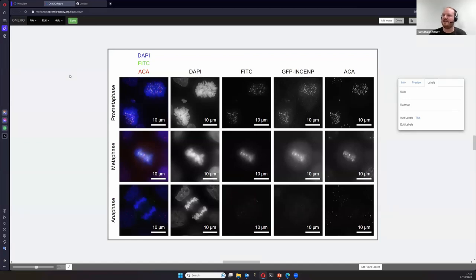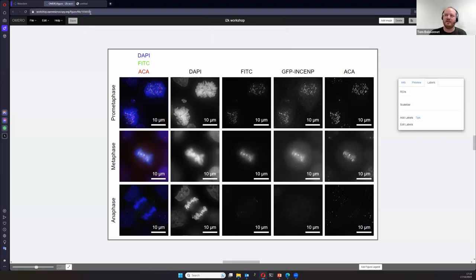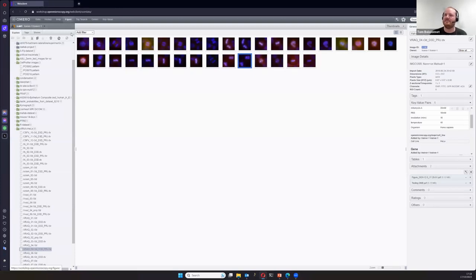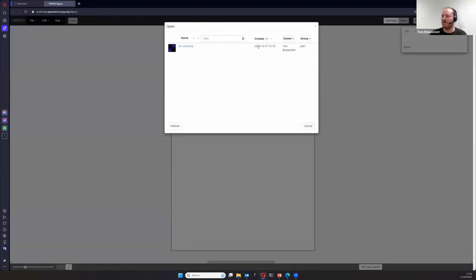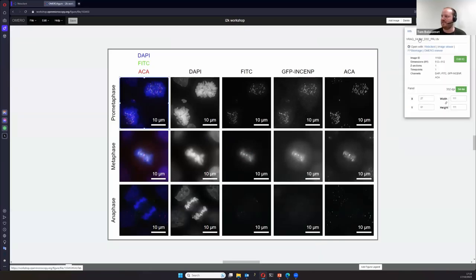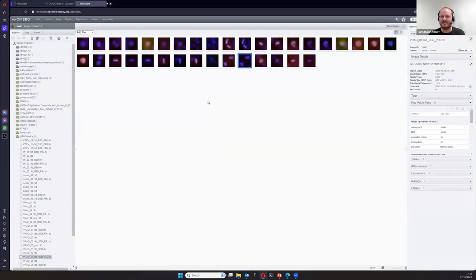That could also be exported as a TIFF to include in a PowerPoint presentation. But where it's very interesting is that you can save your figure — this creates a link you can share with collaborators who have access to your OMERO account. If I leave my figure for six months and come back, I can reopen it in OMERO Figure, find the file, and select an image to find back links to the web client showing me exactly where the images come from and what is their source.